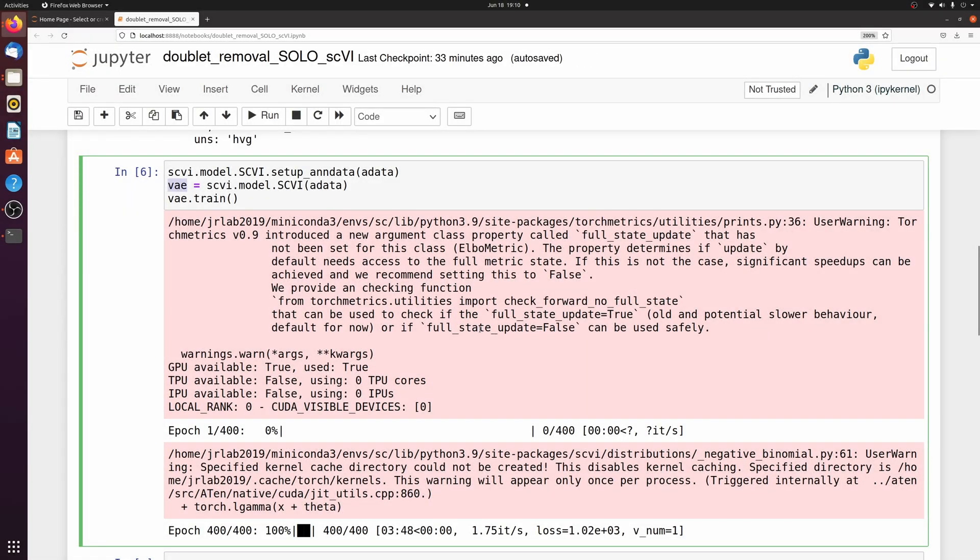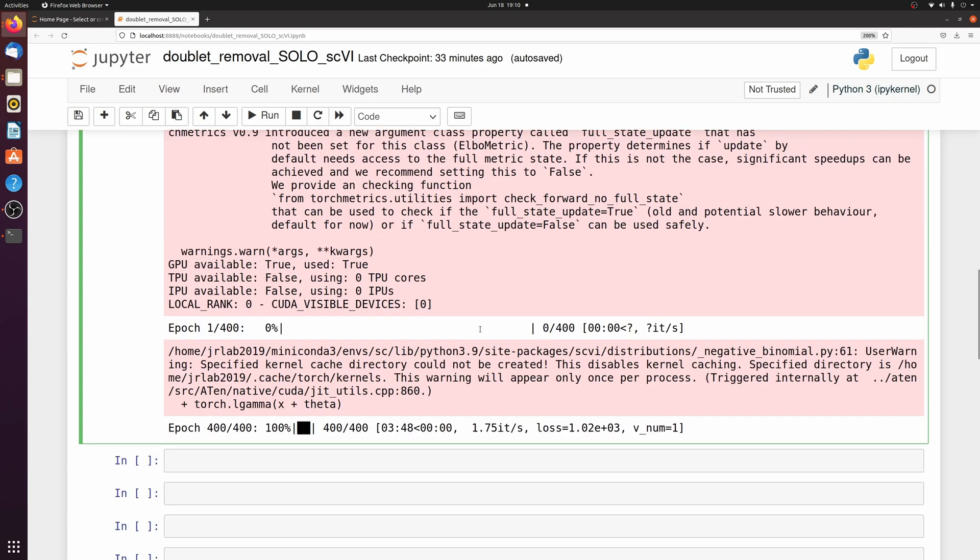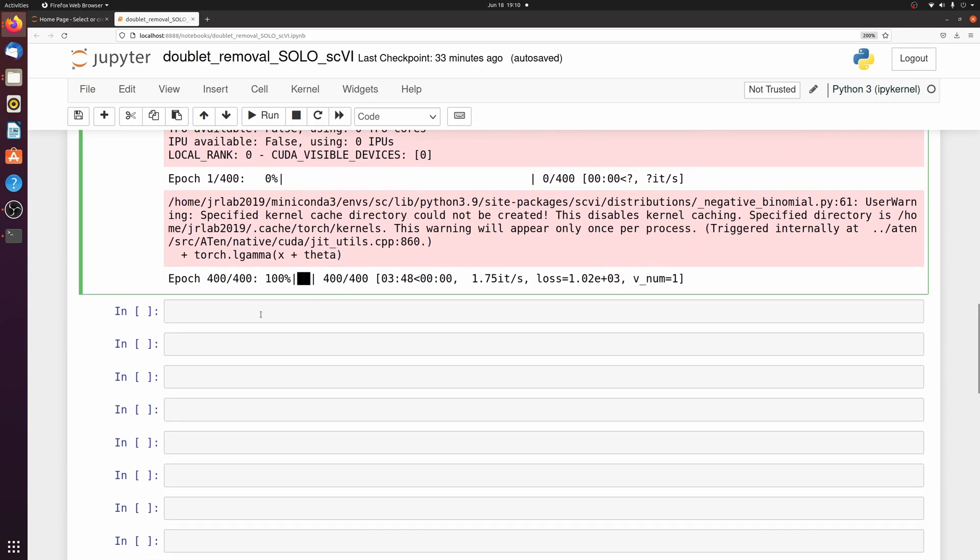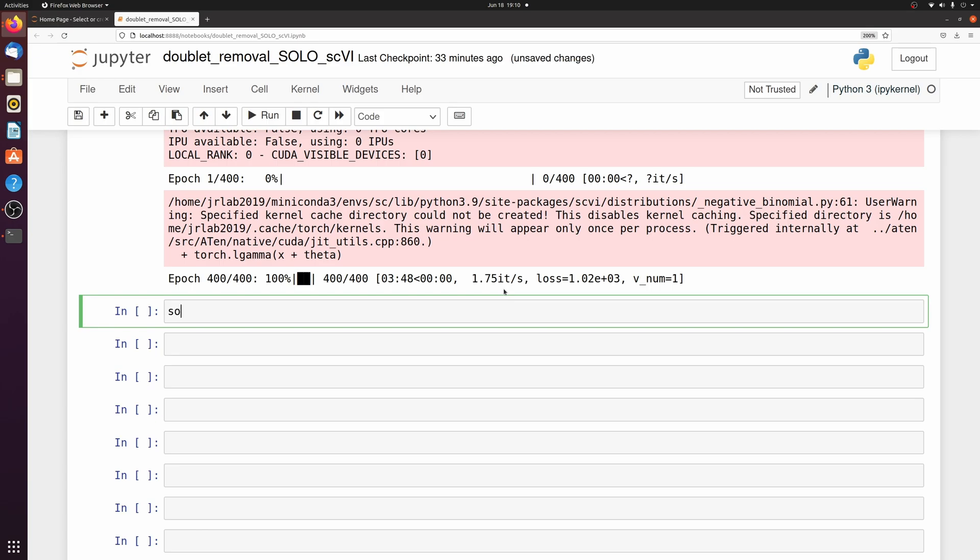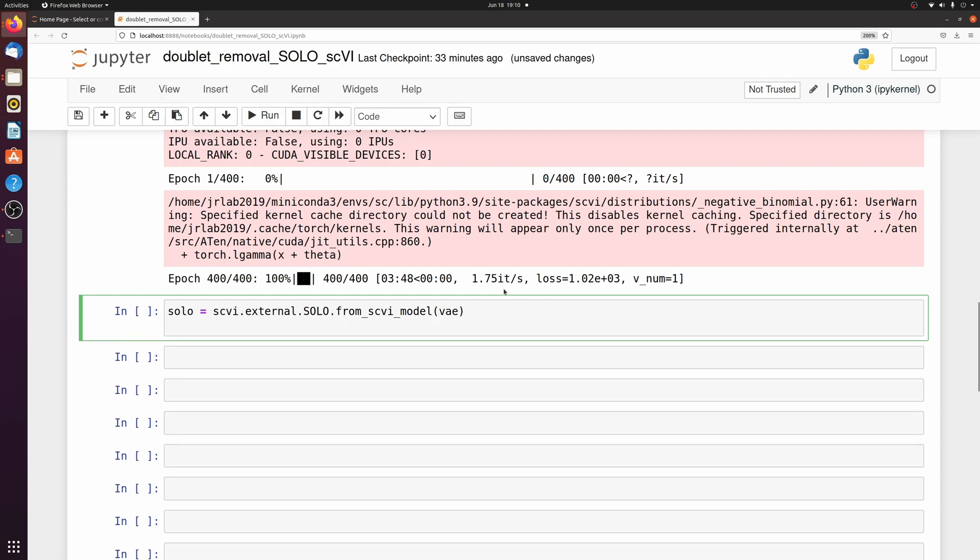So now we have to train the SOLO model that detects the doublets. We'll just make a new object called solo and then we'll call scvi.external.SOLO from the scvi model which is the VAE. And then we're going to train that with solo.train.